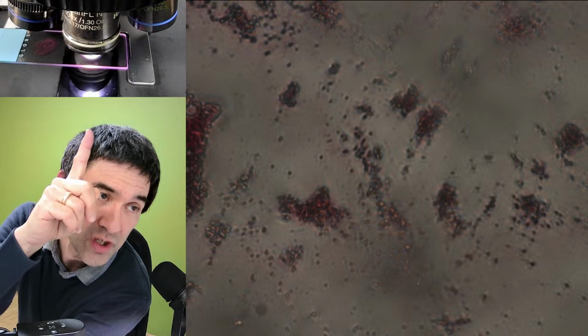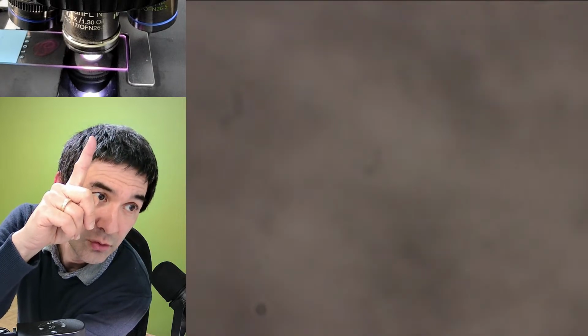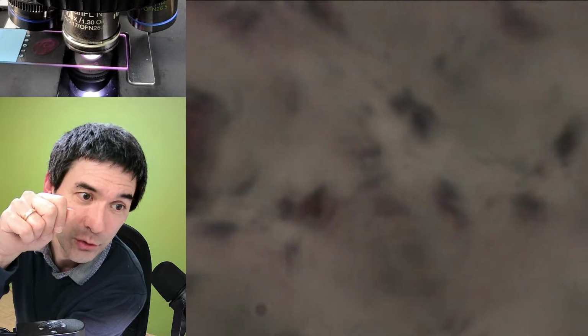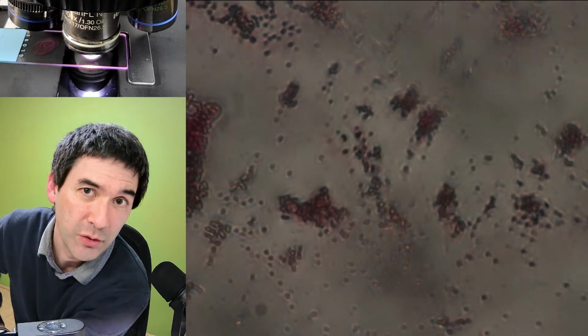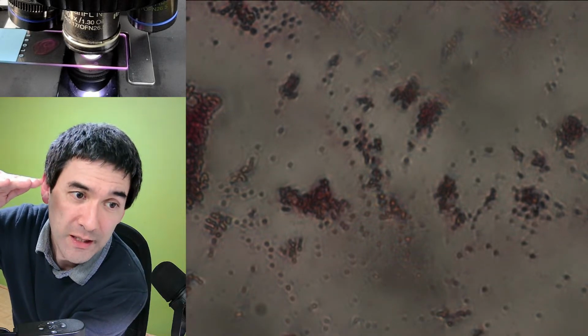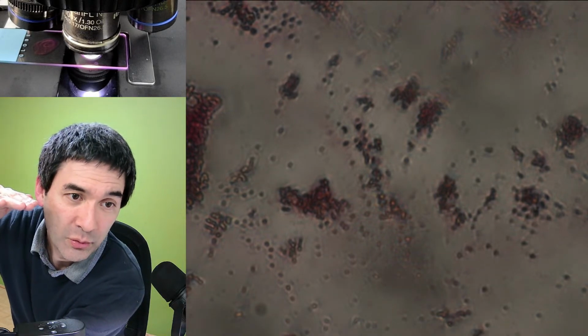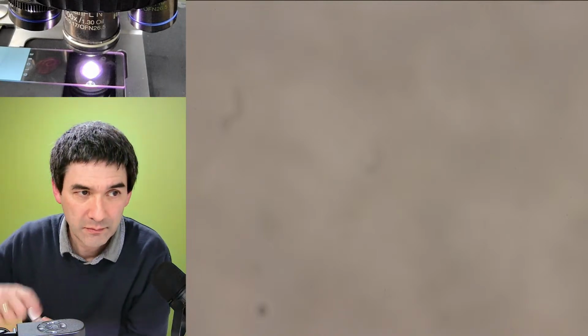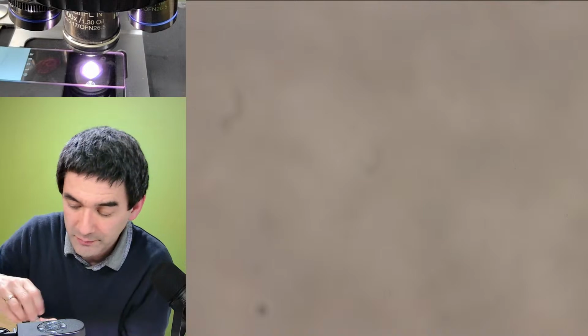I'm now using my coarse focus knob to lower the stage, and now I'm moving it up again all the way, and it stops here already. I cannot crash the stage into the objective because it remembered the topmost position. So I'm going to lower this and add a drop of immersion oil. You just watch what I'm doing here at the top.